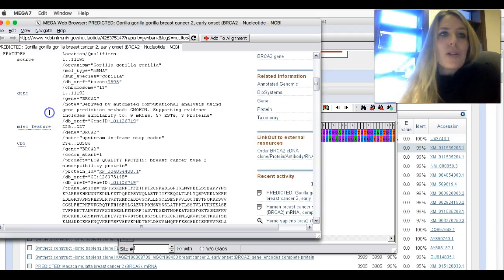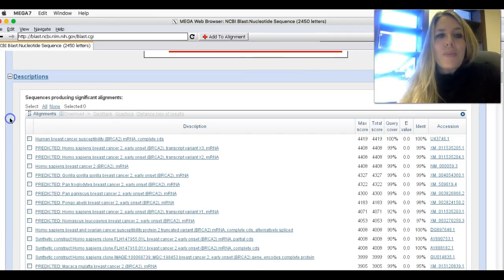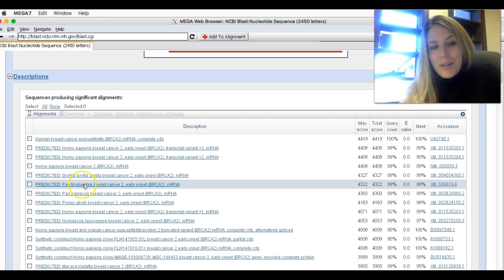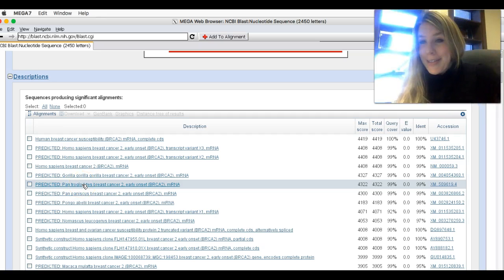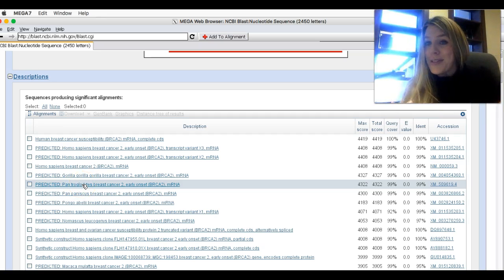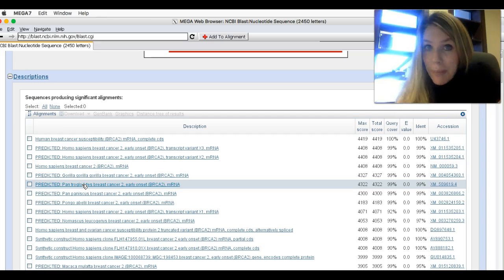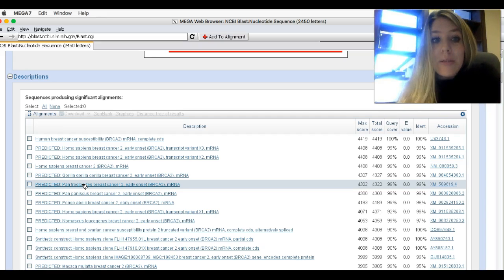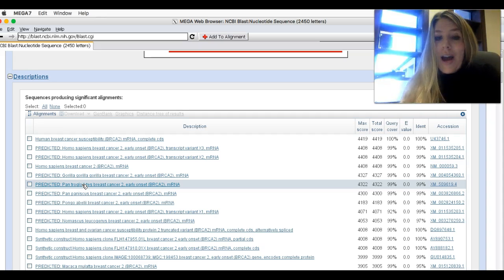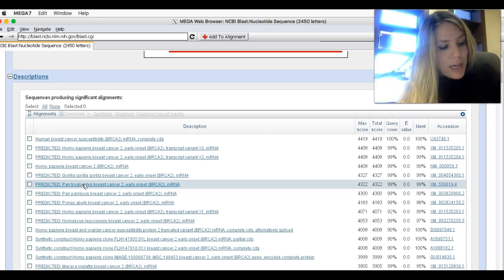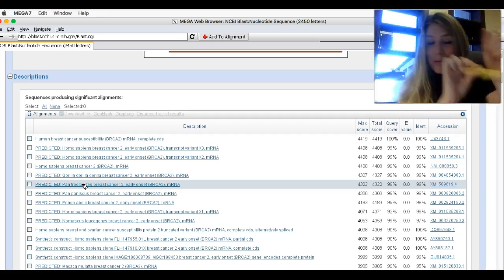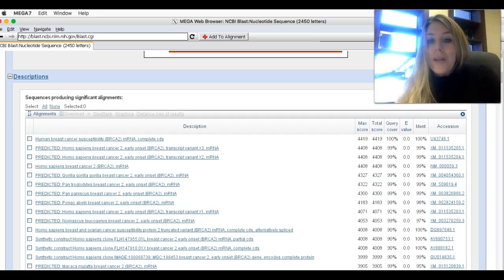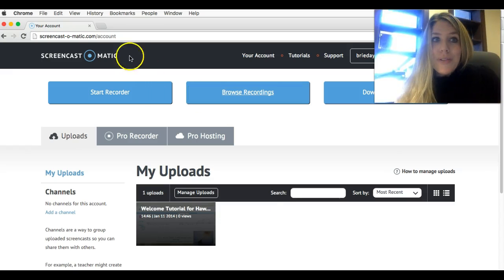I'm going to close out that window, go back to my blast search, and I'm going to enter the next one, Pan troglodytes. That's a chimp. Now, if I didn't know that Pan troglodytes was a chimp, here is how you can figure it out. Write down the name Pan troglodytes, so I don't forget how to spell it. Open up Google.